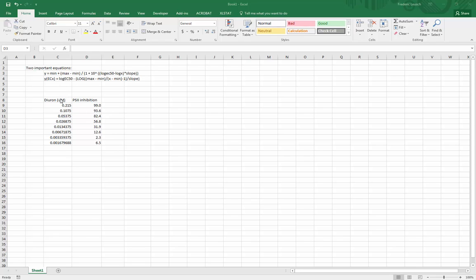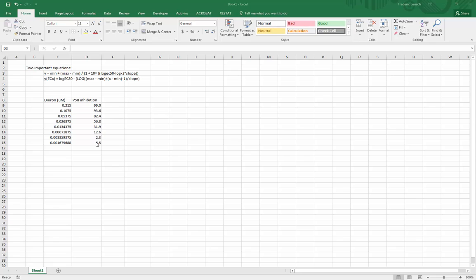Here's an example of some bioassay data. This is an IPAM, it's an assay that looks at photosynthesis inhibition. This is diuron concentration, this is a herbicide in micromolar, decreasing diuron concentration in micromolar, and here's the photosynthesis 2 inhibition as a percent. So 99% inhibited at 0.2 and only 6.5% inhibited at this lower concentration here.